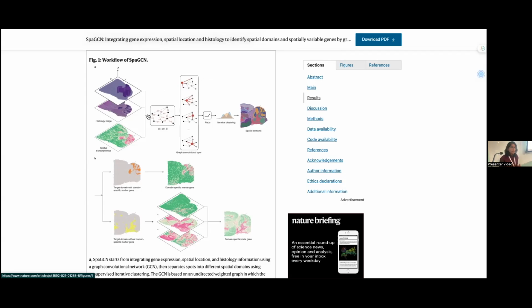It makes sense, except that the thing I question, because I do image analysis, is that the value of organization from an image is not from RGB values. It's from the pixel organizational values, how the pixels are distributed. So I would argue against it.